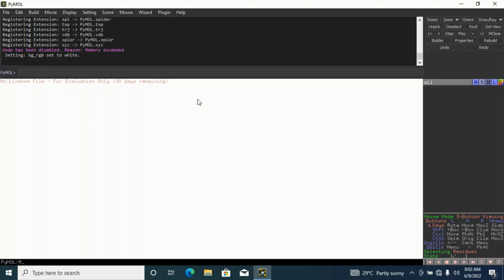Remember, I told you that you can perform several functions with this particular software. It's not limited to what I just mentioned. The more you make use of it, the more you find out about it.